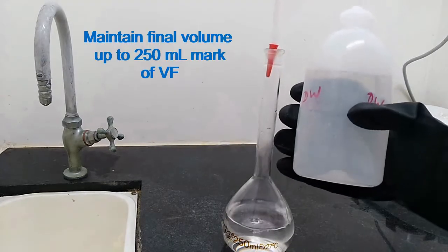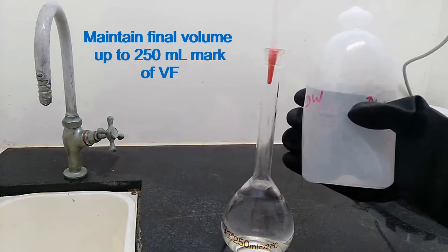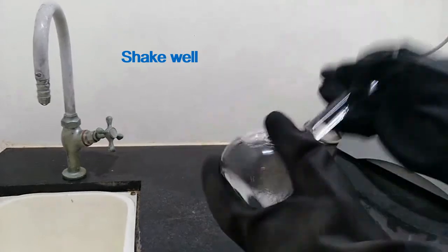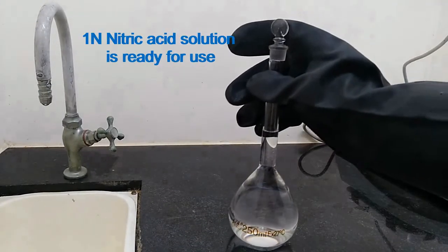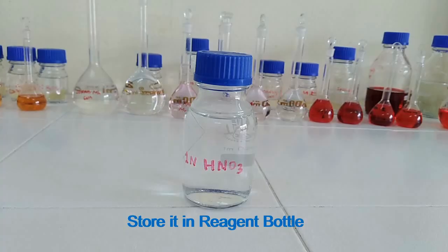Maintain the final volume up to the 250 ml mark of the volumetric flask. 1N nitric acid solution is ready for use. Store it in a reagent bottle.